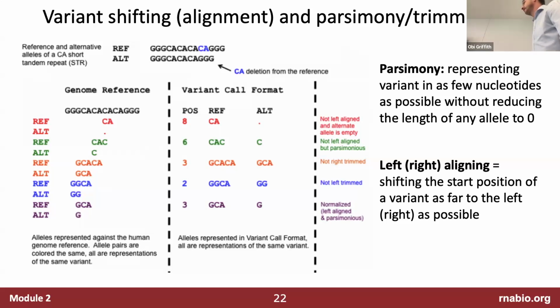What would I recommend? I will say that the purpose of this kind of mini lecture, I think this topic is actually even on Wikipedia. One recommendation is to certainly favor one kind of alignment, either left or right. Unfortunately, we can't agree on which should be the right one.